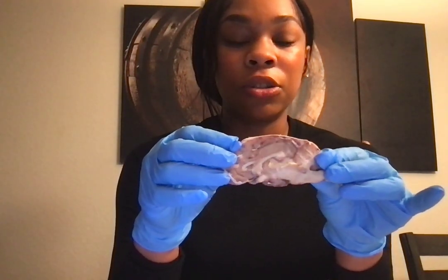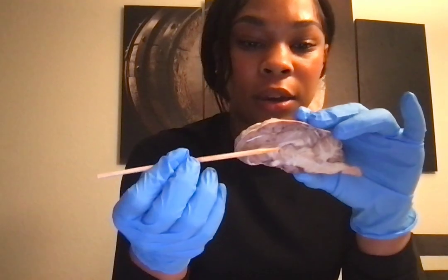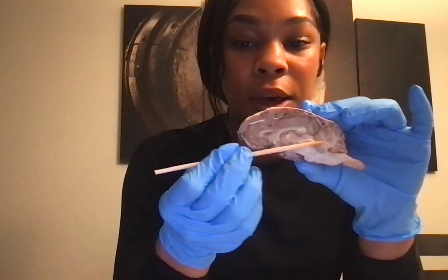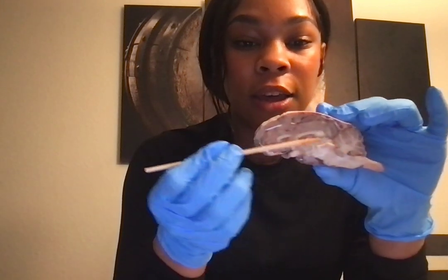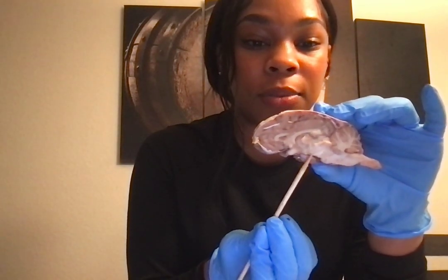Now, when I cut it in half, this is called the sagittal view, and the sagittal view just divides the brain into left and right sides. So over here we have the corpus callosum, we have the cerebellum right here, we have the pons, and then up towards the front we have the thalamus, and then over here is the hypothalamus.